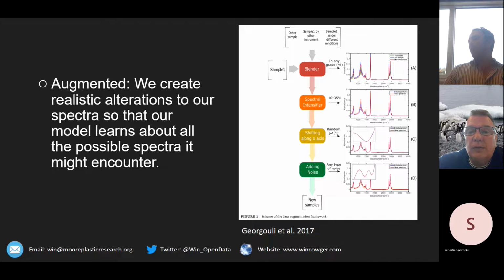Wow. Do the polypropylene signatures show up when you do transmission through the polypropylene supported ones? Yes, for sure. But we also use it as an internal standard to check if everything runs well. Normally we see any issue, either from the instrument or from people handling the microscope, directly in the signal of the PP at the corners of our image.